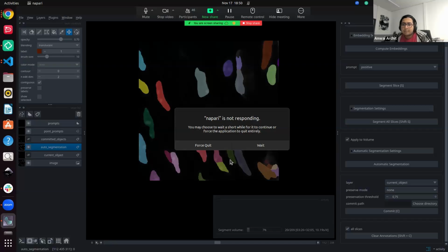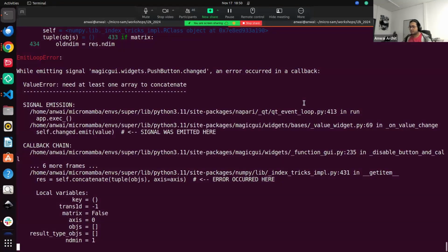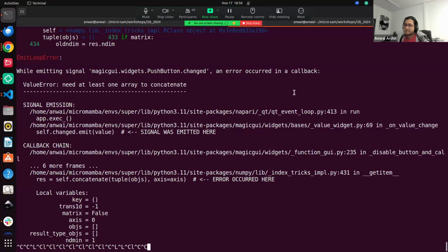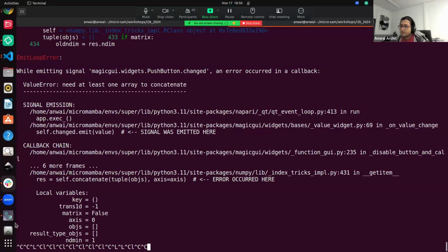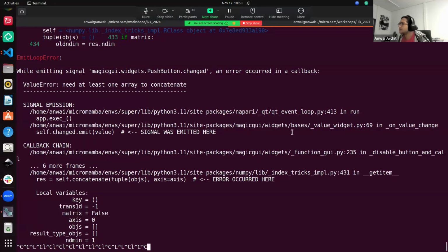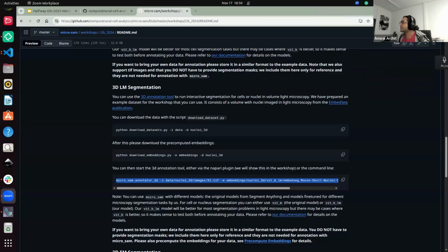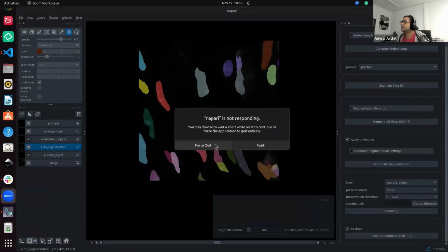So yeah. Bright field, can you give me an example? I'm very curious about what you're talking about. Or maybe I can search it up with you guys together. This will take a while, probably. I will close this, but we can chat about questions. Let me move this aside. Force quit.